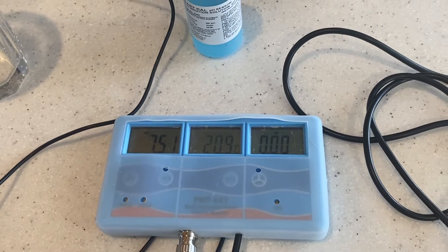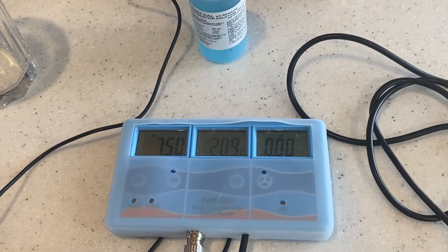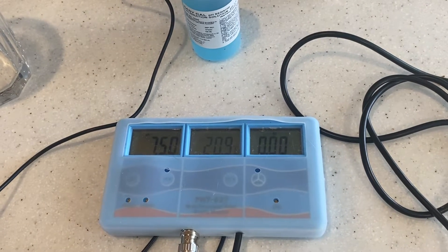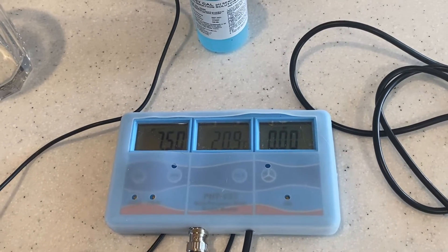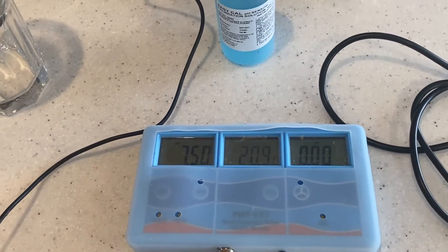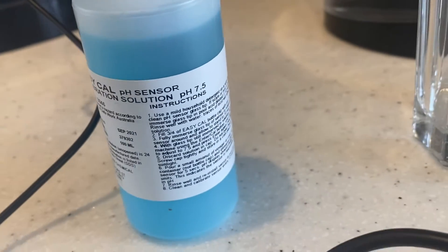This is a quick test to show the pH coming out of the WatersCo filter systems. We're going to start with a digital pH meter that is currently calibrated and sitting in a solution at 7.5.